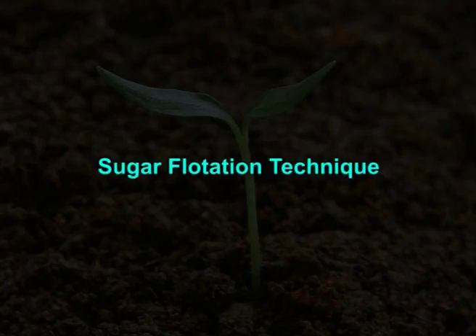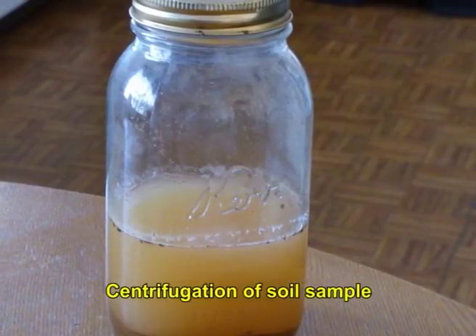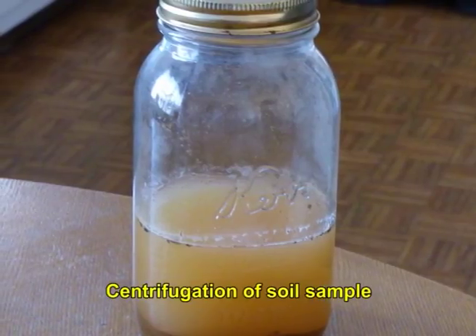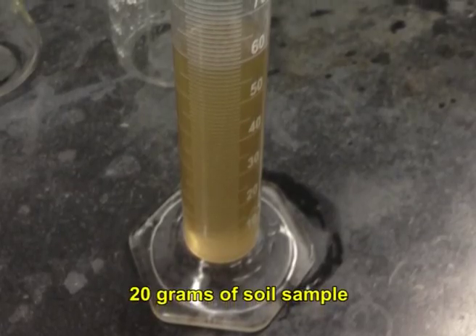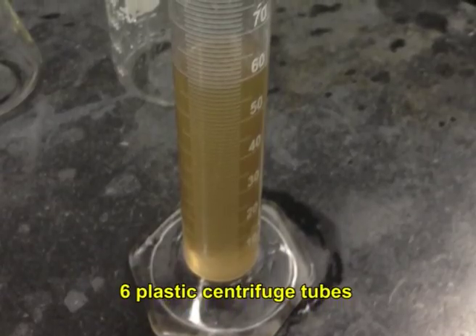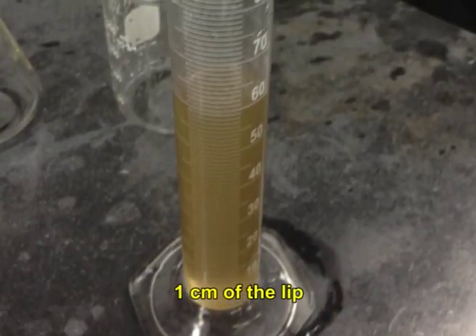Sugar flotation technique. This method involves centrifugation of a soil sample in a sugar solution, which suspends the nematodes in the supernatant while the soil particles get deposited at the bottom. About 20 grams of soil sample was taken in each of 6 plastic centrifuge tubes and water was added to it within 1 centimeter of the lip.